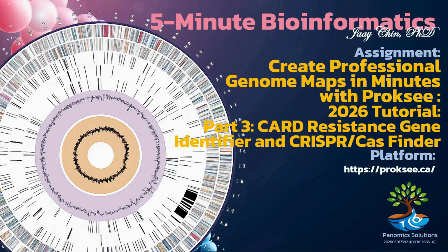In this 5-minute session, we'll show you how to create professional genome maps in just minutes using Proksee. This is part 3 of our 2026 tutorial series, where we focus on: 1. Card Resistance Gene Identifier. We will learn how to quickly detect antibiotic resistance genes in your genome. 2. CRISPR, Cas Finder, to identify and visualize CRISPR arrays and Cas proteins. By the end of this tutorial, you will be able to generate clear, publication-ready genome maps and gain insights into your bacterial or microbial genome maps.